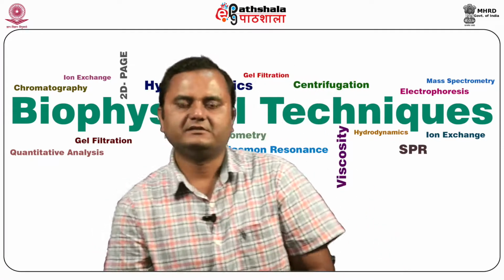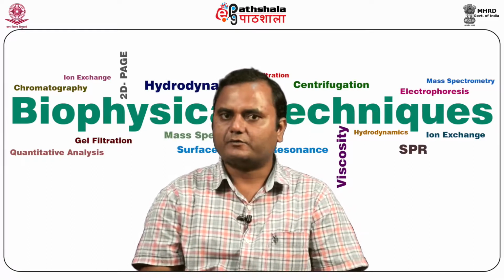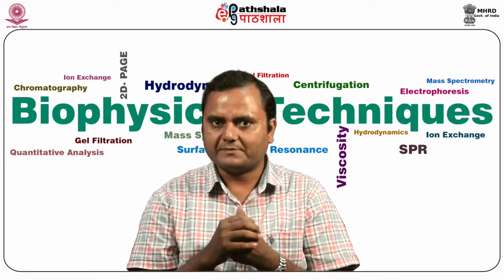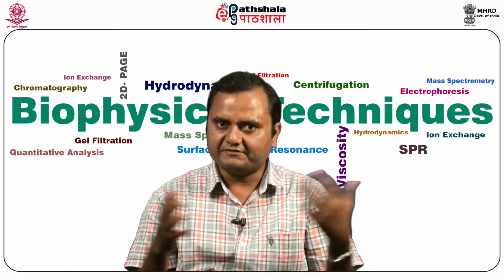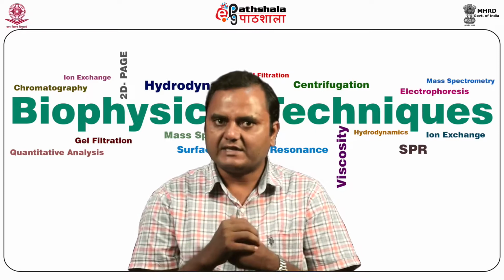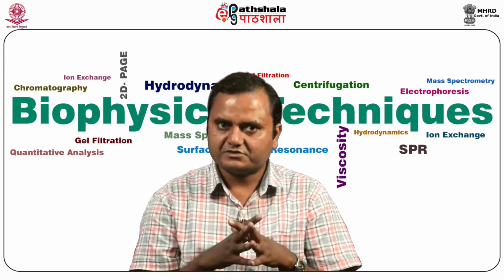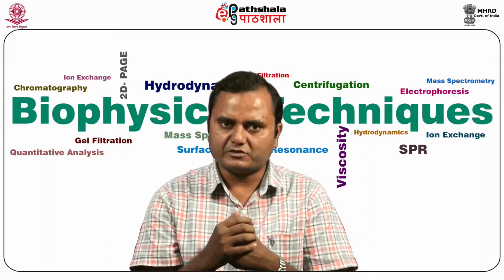Sedimentation velocity is the best method used for the calculation of biomolecular shape. Like if in a mixture you have molecules with different shapes, that can easily be analyzed using the analytical ultracentrifuge, and the method is based on sedimentation velocity.